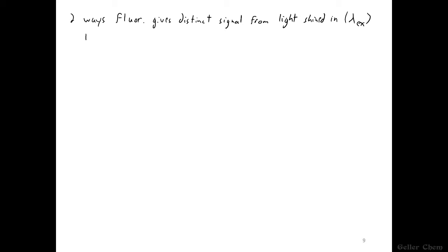The first way has already been addressed previously. The wavelength of that emitted light is greater than the wavelength of the excitation light. And we already covered the reason for that in the last lecture and in today's recap. So that alone is a rather big tell, that the emitted light is different in wavelength than what we're sending in. The other thing we do that has not been discussed is we set the detector perpendicular to the path of light shined in.